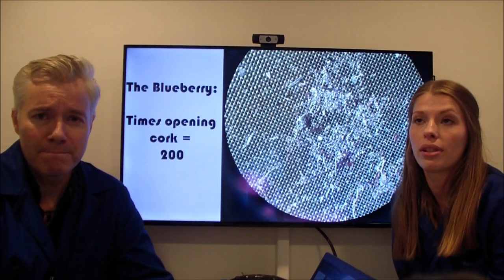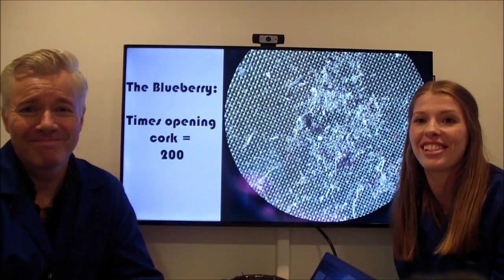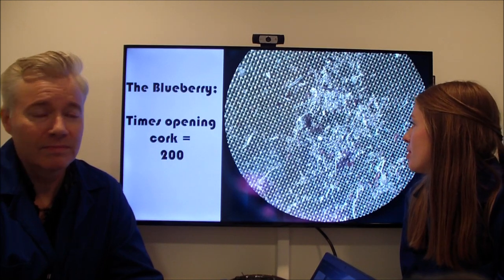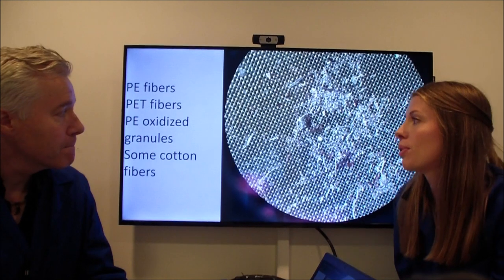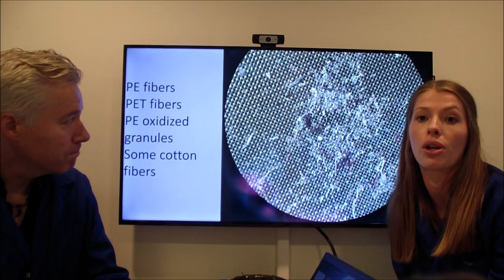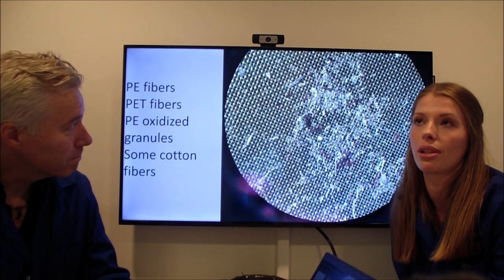And this is the blueberry sample, which we opened and closed 200 times, and you can clearly see an increase in the amount of particles. We found lots of different fibers, which you can see here: polyethylene, PET fibers and polyethylene granulates, and also some cotton fibers.